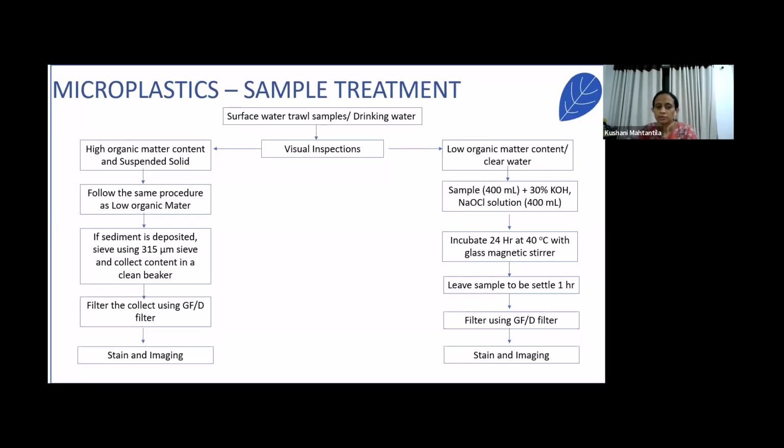We work with CFAS UK, and this method was developed by them, and in the laboratory network, they use the same methods, same net sizes, to compare the results. So as far as possible, within several countries, they have employed laboratories and used the same method in order to compare the results. So this is the method, and this method gives 80% recovery.